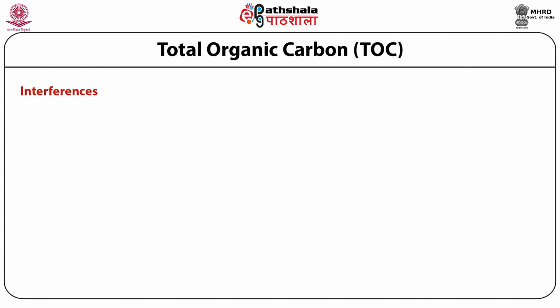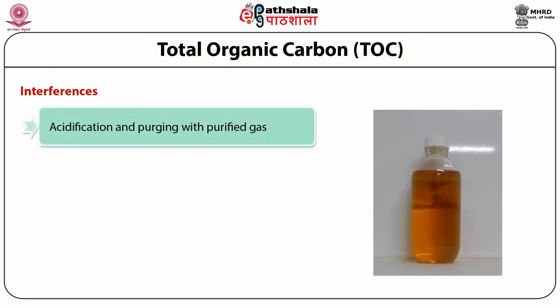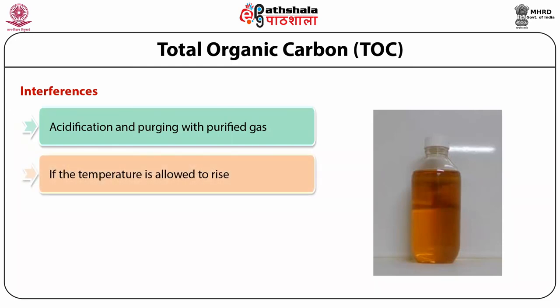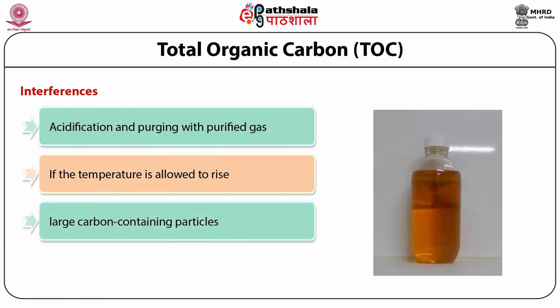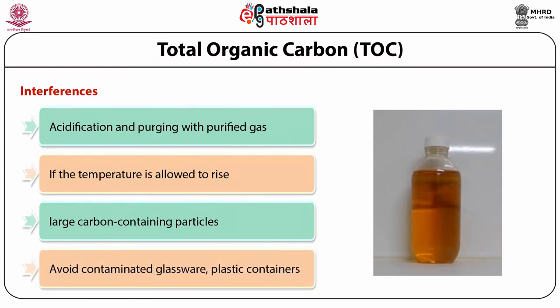The major interferences in TOC determination include removal of carbonates and bicarbonates by acidification and purging, which can result in loss of volatile organic substances. Volatile losses can also occur during sample blending if the temperature is allowed to rise. Another important loss occurs if large carbon-containing particles fail to enter the injection needle. To minimize these, avoid contaminated glassware, plastic containers, and rubber tubing, and analyze a reagent blank following the same treatment procedure as the wastewater sample.